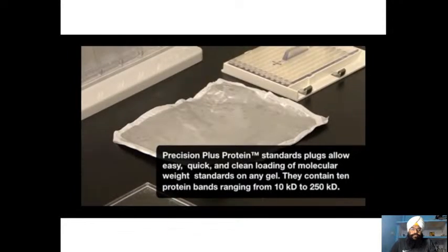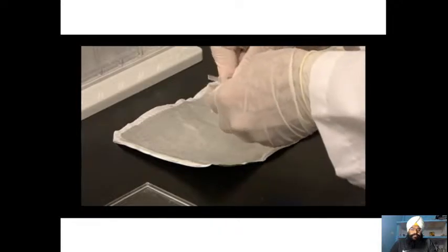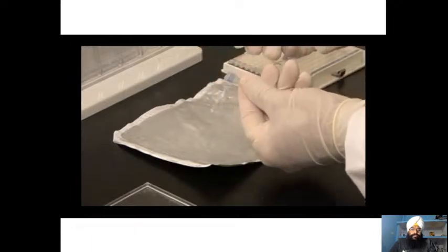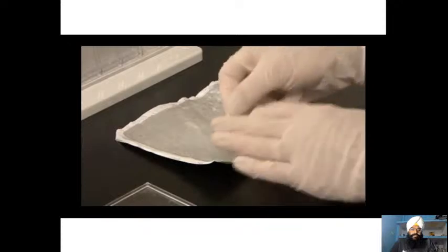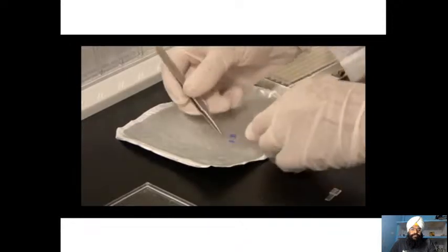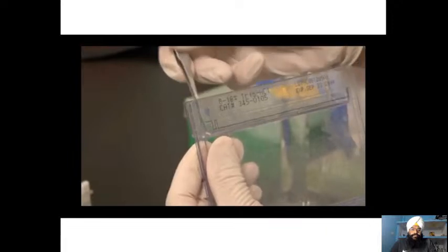Now I will insert a Precision Plus standard plug, which is a broad range standard that has been embedded in agarose, into the reference well on the right side of the gel. Break off one plug, hold onto the handle and break off the spatula, and using the spatula, push out the agarose plug. For Criterion gels, I usually cut the plug into 4 slices to match the size of the well. In this case, I need 1. With forceps, take one of the slices, place it on the back of the gel cassette over the reference well, and gently push the plug into the reference well.